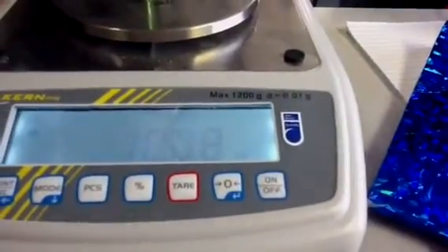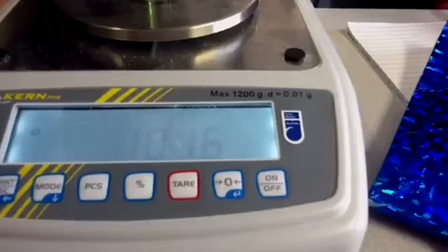So how much did it weigh? Ten. Sixteen. One six. No, you just put it down. Yeah, it's the measurement.